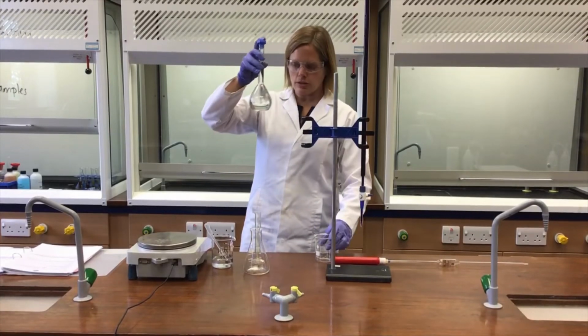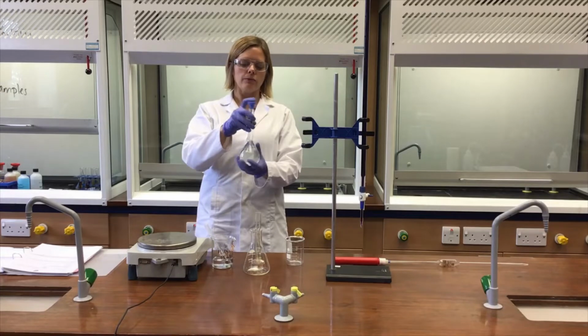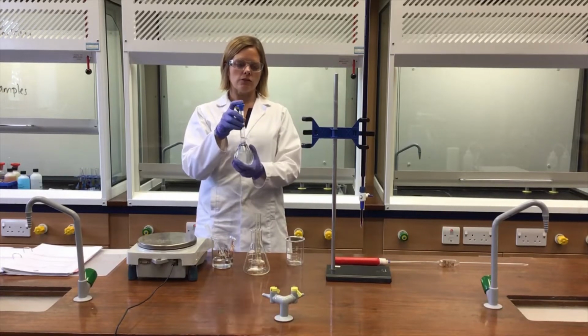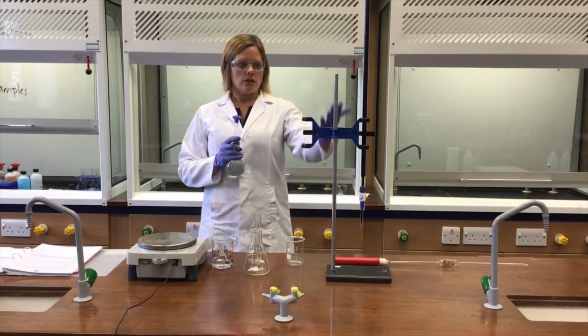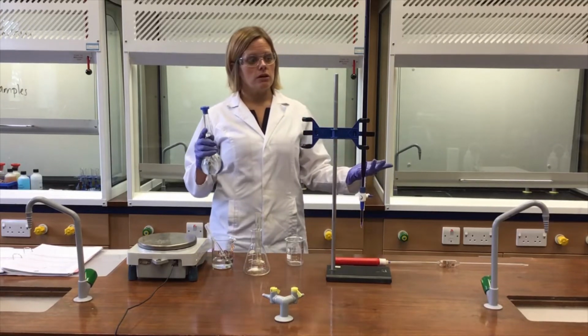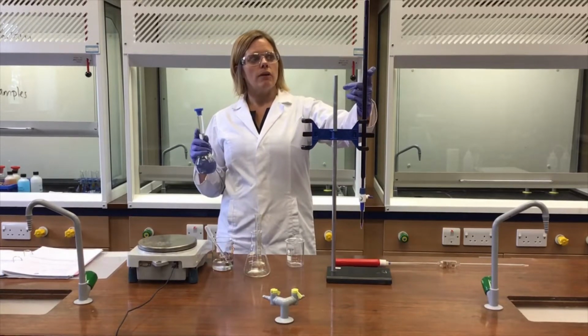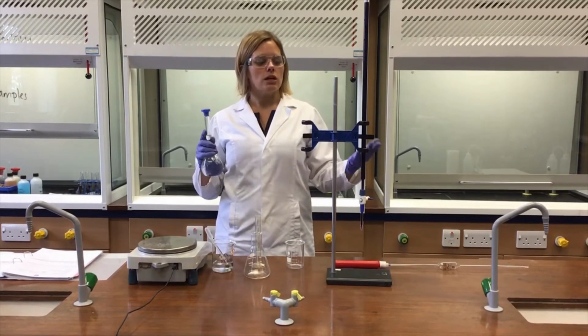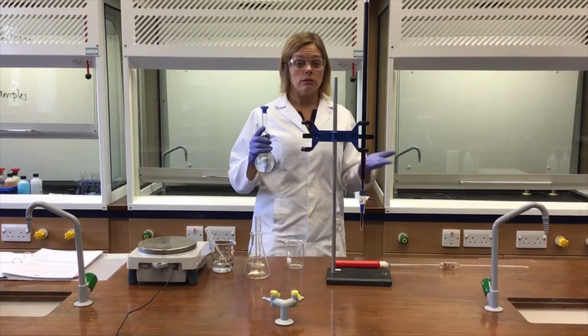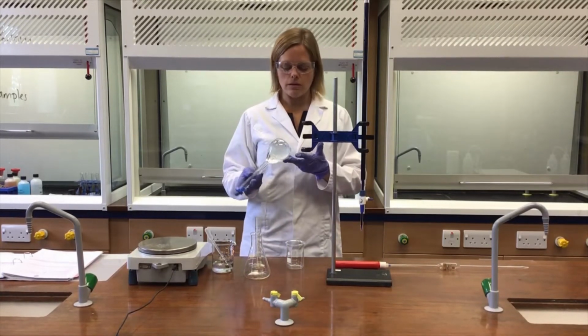So here's the solution that we made up containing iron 2, and it's the iron 2 part of that compound which reacts in the redox titration. For a redox titration, the apparatus is really just the same as an acid-base titration, but as you will see in a few moments' time, the reagent in the burette, the potassium manganate 7, changes colour itself during the redox reaction, and therefore no indicator is used, so that's about the only difference.